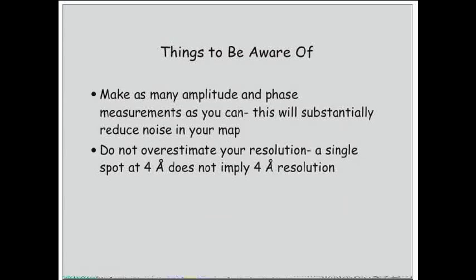Get as much data as you can. Don't overestimate your resolution. Just because you see a spot at 4 angstroms resolution doesn't mean you have 4 angstroms resolution.